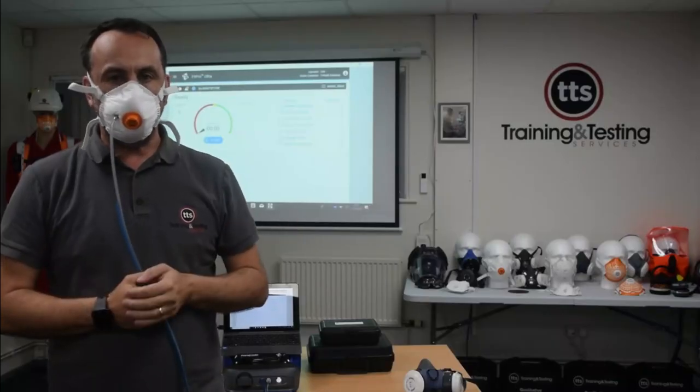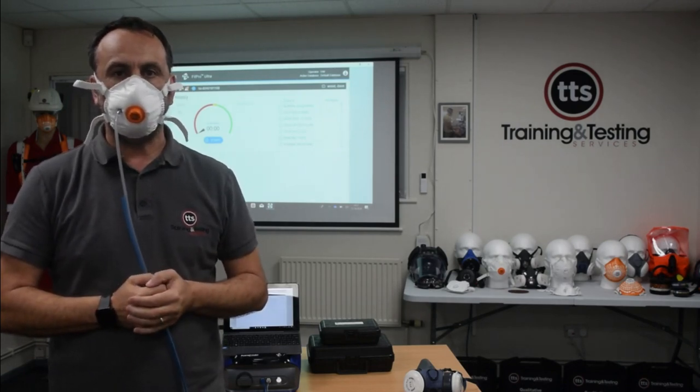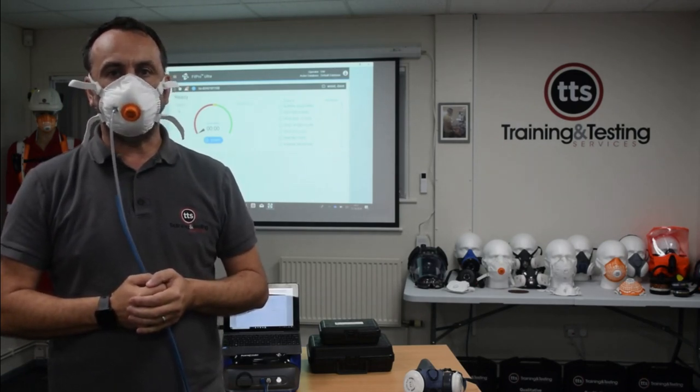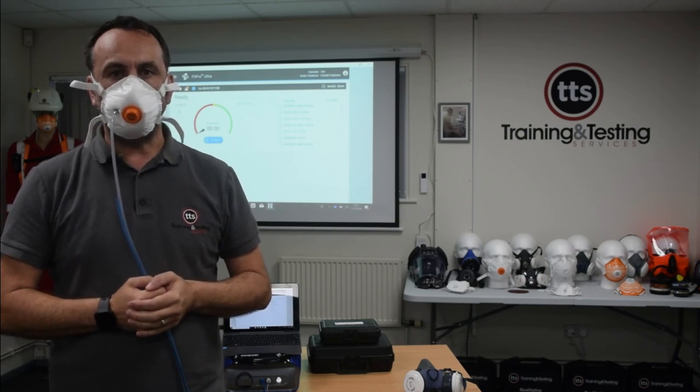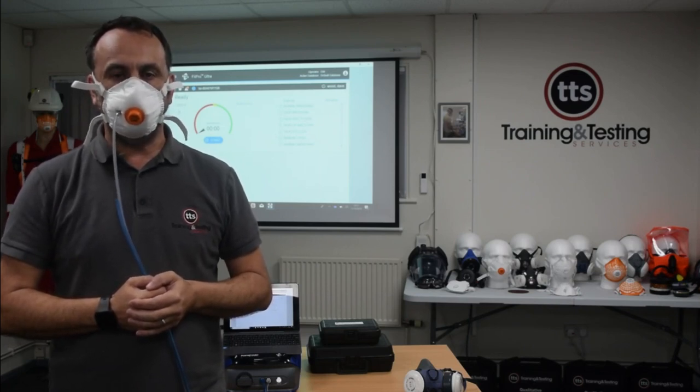So I've now fitted the mask. The next stage is I need to start doing some exercises. For the test, there are 7 simple exercises to do. The machine will tell me exactly what to do, and as a qualified fit tester, I know what to do anyway. What we will do is just keep going through the exercise sequence. If we get to the end and we get a pass, we will discuss that at the very end.